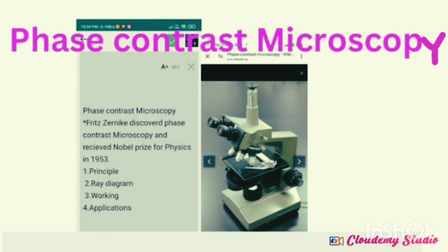Hello students, in this lecture we are going to discuss in detail the phase contrast microscopy. This phase contrast microscopy was discovered by the scientist Fritz Zernike, and for that he got the Nobel Prize for Physics in 1953. In this microscopy we are going to discuss principle, ray diagram, working and applications one by one.